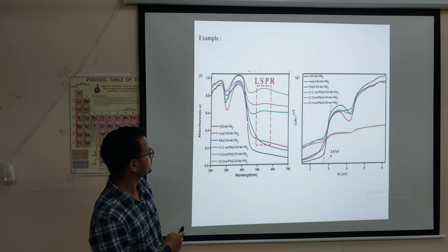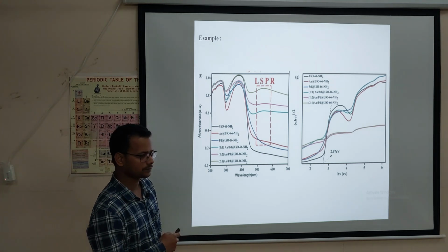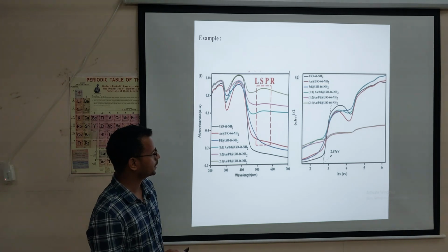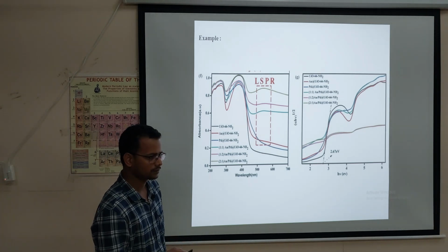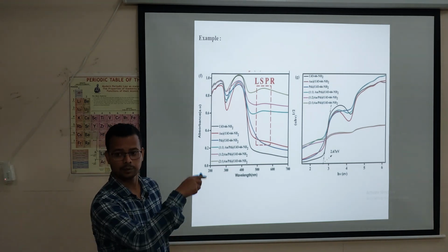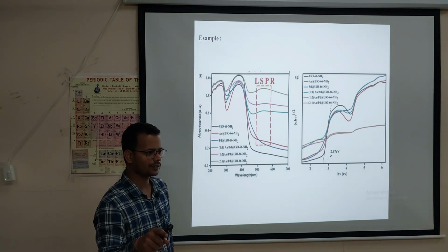Then what I get here, you just see, some peaks arise here. Okay, and it will show some different band gaps. The band gap I found was 2.67 for the metal NH2, and for the rest I have not calculated here. Okay, so such a type of graph we will get from UV-Vis DRS. Such a type of graph, not that type of Z graph. If you get that type of graph, then you should be sure that your sample is not the right sample.